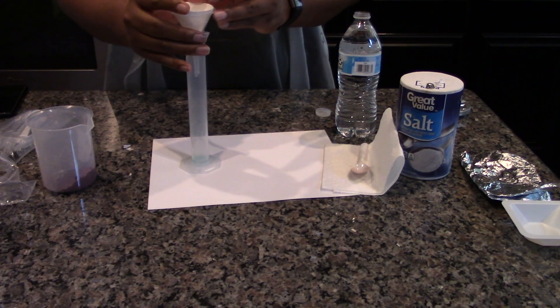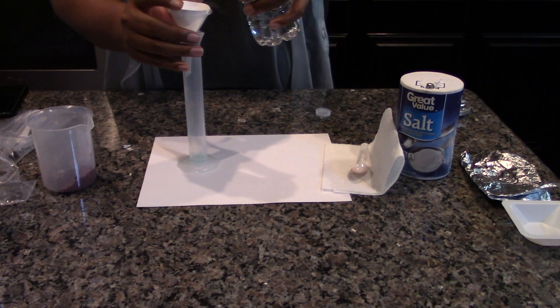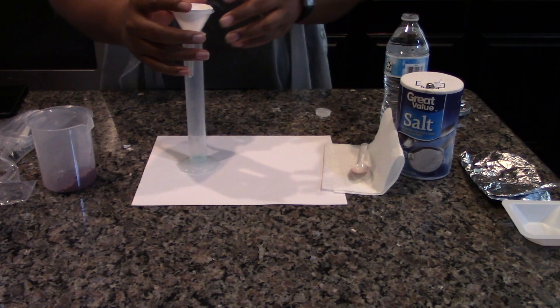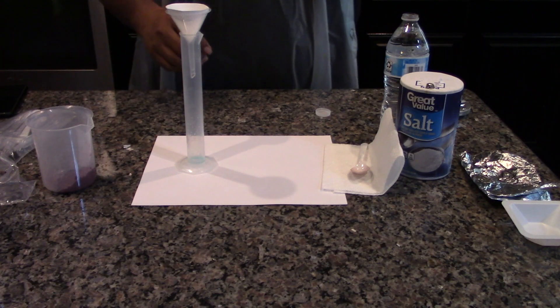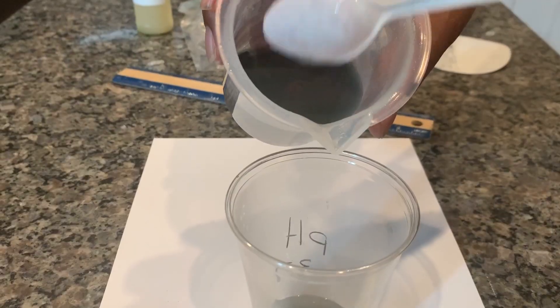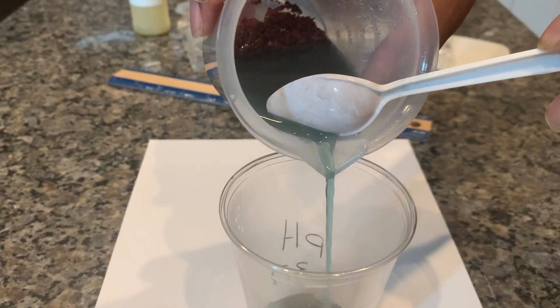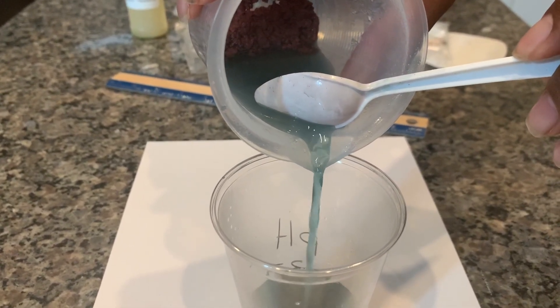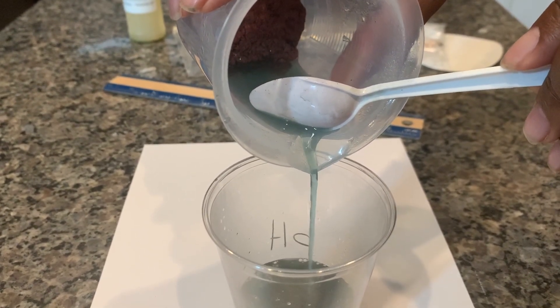Put the filter paper down into the funnel until it is flush with the walls. Place the filter funnel on top of the 50 milliliter graduated cylinder. When no more aluminum foil is observed and the copper has settled to the bottom of the beaker, carefully decant the solution into a plastic cup. Use the spoon to keep all the solid copper in the beaker. Pour out as much of the solution as possible without losing any copper solid.